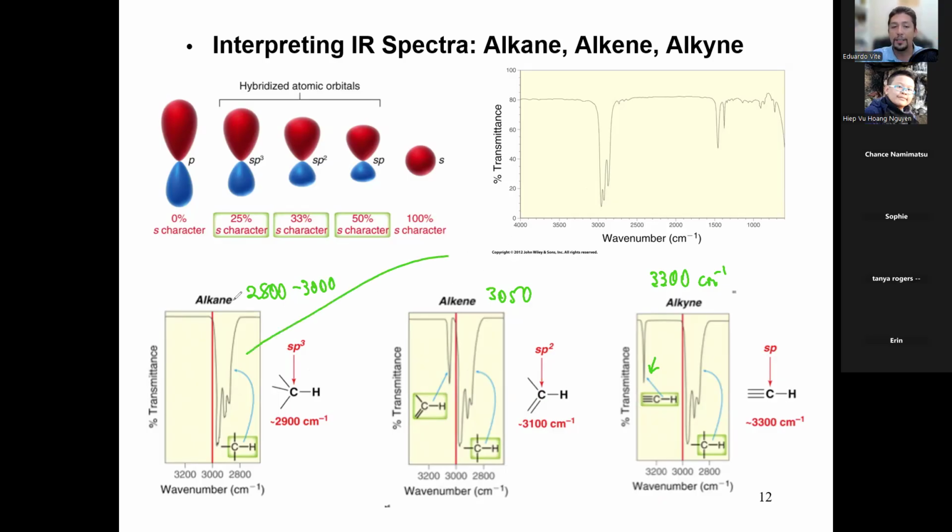That is always going to be there because in organic chemistry, we study the chemistry of carbon, and carbon will always want to make four bonds. And if there's nothing else, it will bond with hydrogen. So all organic molecules have CH bonds. So you will always see this shape in IR spectra of organic molecules.